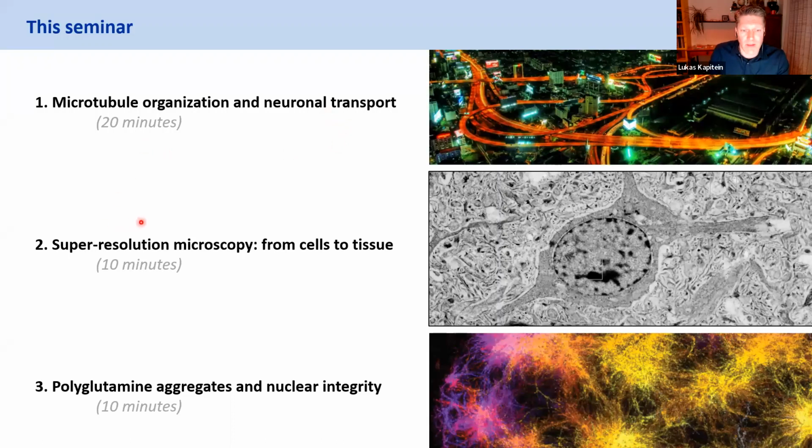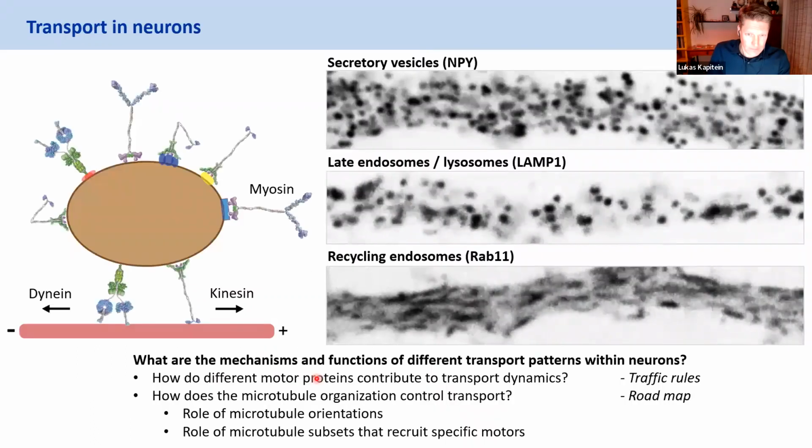Then a recent effort to take our super-resolution microscopy not just from cells cultured on glass to really tissue systems. And then finally, I will spend a bit of time on this recent work on aggregates and how they impact nuclear integrity. But first, transport.